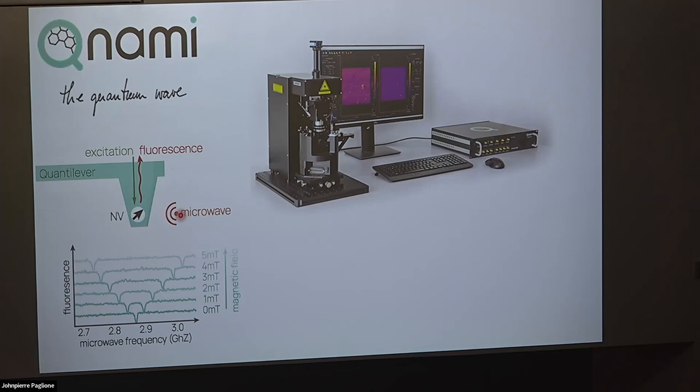You do that early on. But what I didn't mention, what's very important for this technique, is the magnetic field. The field changes as R to the minus 3. It's a cubic dependence, so it's very sensitive. Basically, this thing is operating in a tapping mode sort of geometry in which we're keeping a constant height as much as possible. I see.